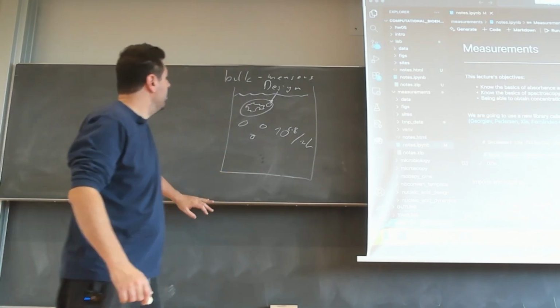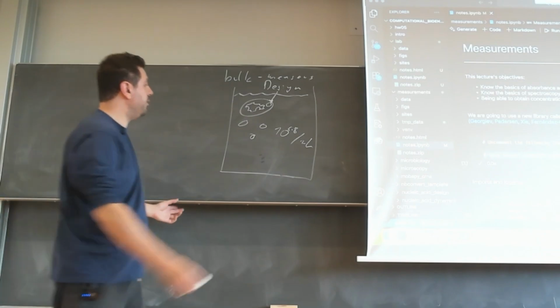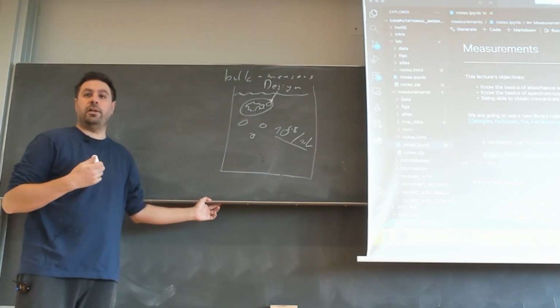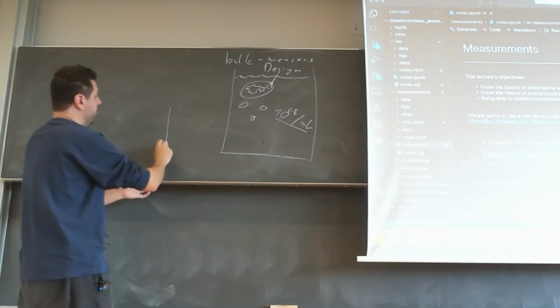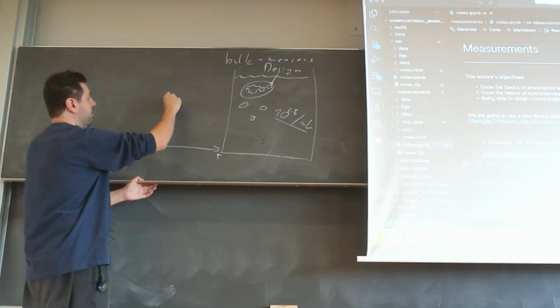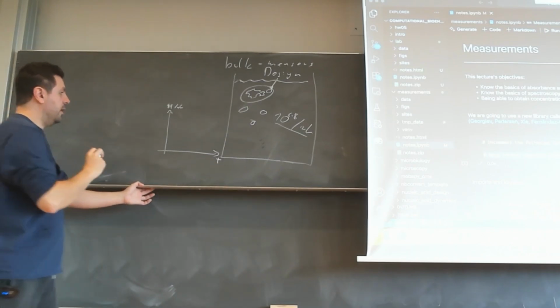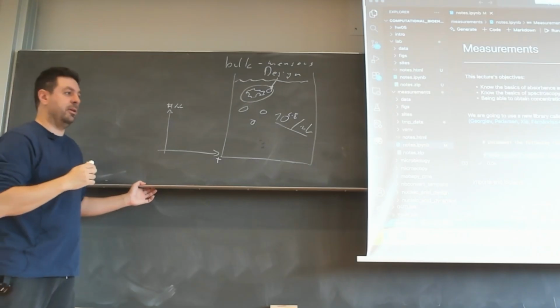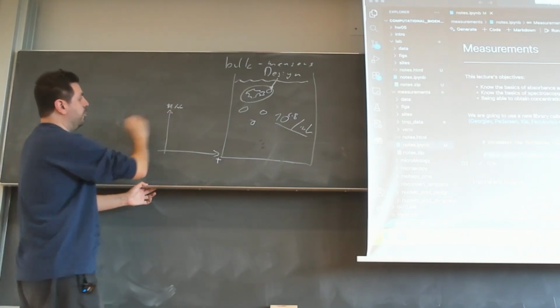What can you measure from this? Very concretely, what you're very often interested in is really this number here. Like how many bacteria are in my culture? So why is this interesting? You can think of the following experiment. Here is our time. Here is our number, or number per ml, so the concentration, right? And we're interested in the so-called growth curve of this cell. In our case, it will be the bacteria E. coli.